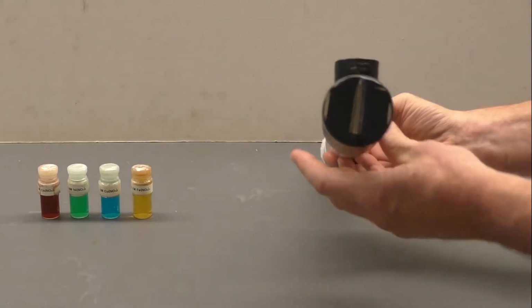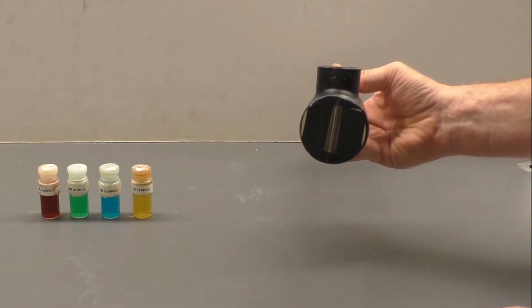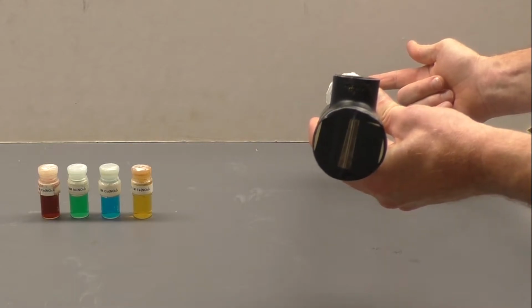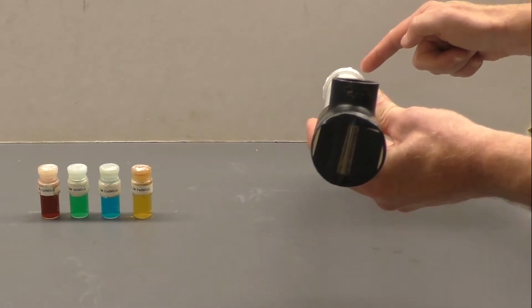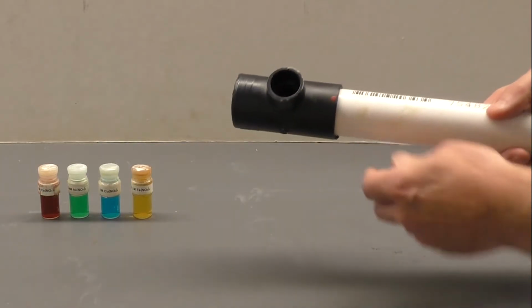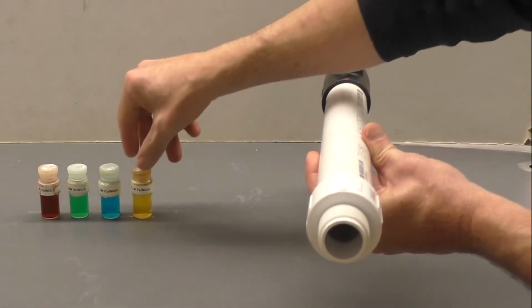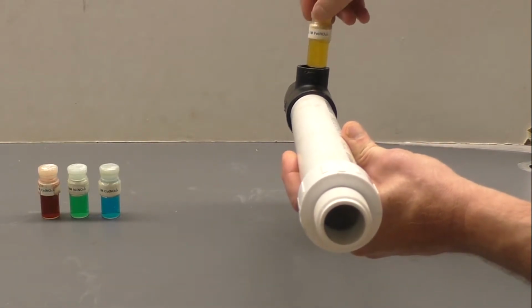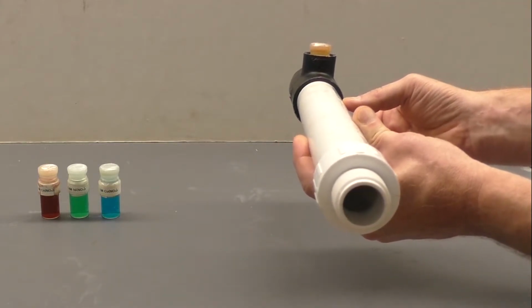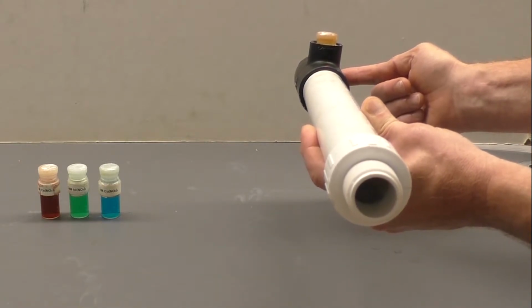On the other end is a slit for the light to pass through. Just like any other spectrometer, light enters through the slit and your eyeball is over here looking at what happens when that light passes through and hits the diffraction grating and is broken into its component colors. This has one added feature, and that is a little hole on the top. That is the hole where we are going to insert one of these little vials. The vial only falls down just far enough so that it blocks only the top half of the light coming in here.